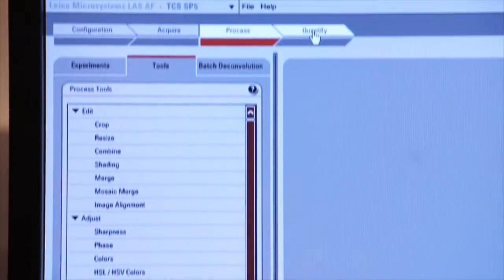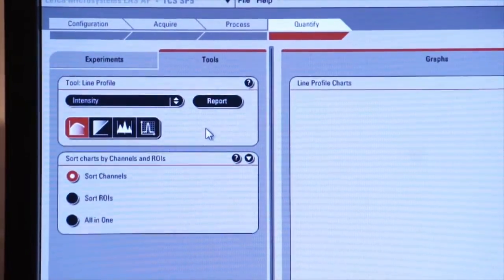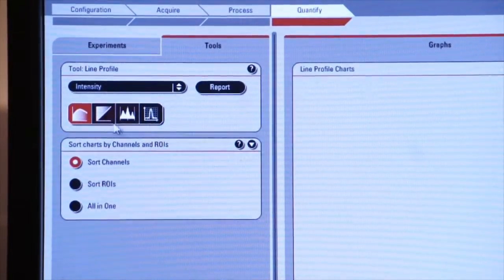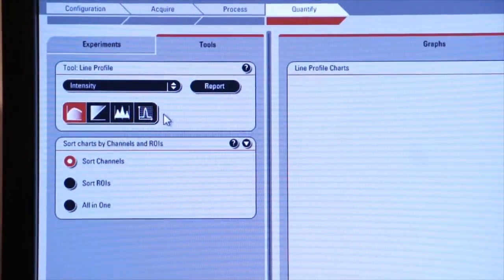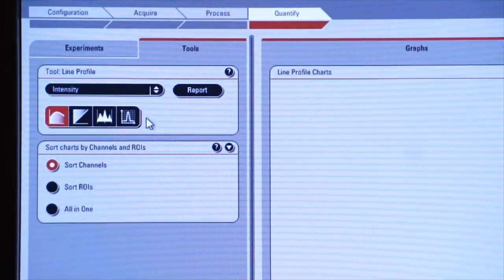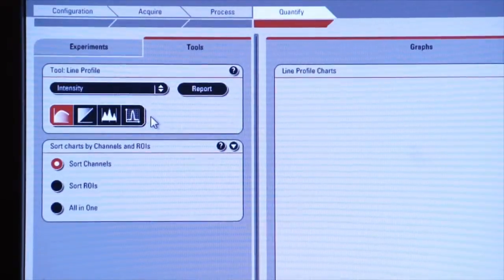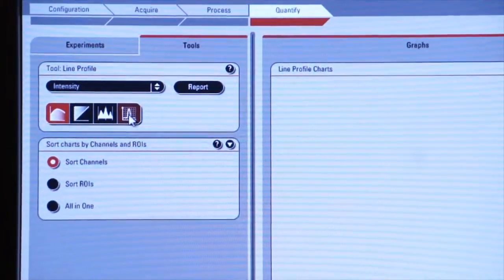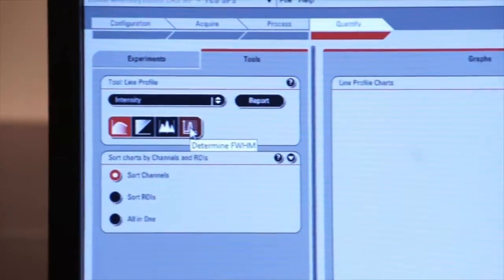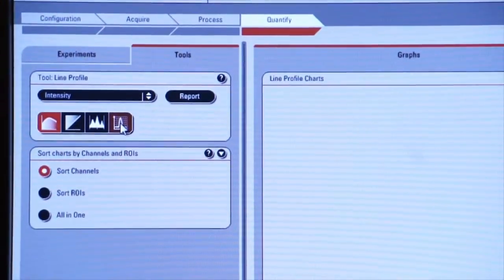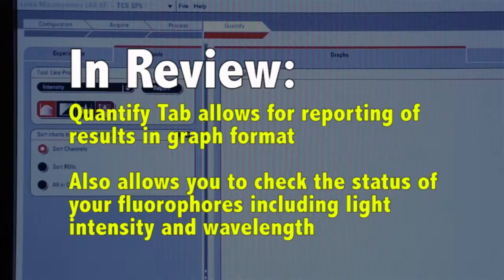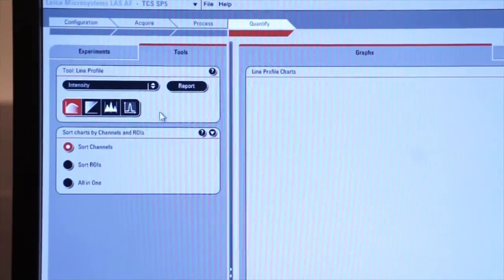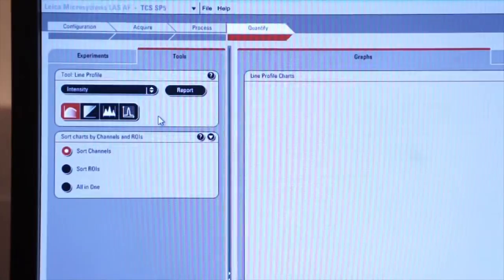The Quantify tab is also very important for reporting your results in a graph format. There are various selections here that you can choose to represent your data in graphic format, in tables, and other such things. You can also look at the activity of the fluorophore, the amount of intensity of the light that's being emitted from the fluorophore, and which wavelengths it's being emitted at. So this is a very useful tab, which you'll also get to know.